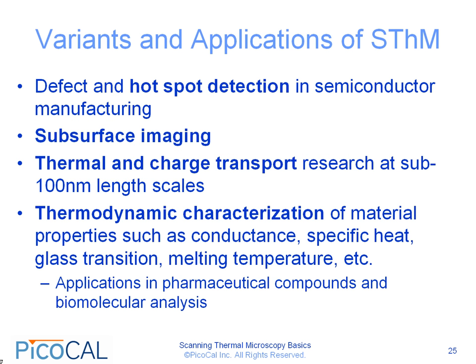There are many applications of scanning thermal microscopy today. One of the major ones is defect and hotspot detection in semiconductor manufacturing. Another interesting use of scanning thermal microscopy is in subsurface imaging. Atomic force microscopy can only detect features at the surface of the material, but scanning thermal microscopy can actually detect subsurface features which change the thermal conductivity of the tip-sample interaction.